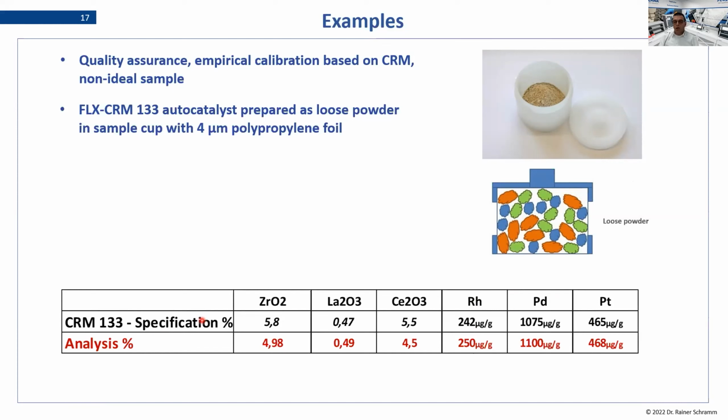And there's a general rule that the higher your atomic number, the more it's possible to use press pellets or loose powders, because of this effect. And the lower your atomic number, when you are looking at light elements, the more difficult it becomes to do press pellets or loose powders for these elements, because the error is increasing a lot. And all these problems start with penetration, fluorescence yield and so on.